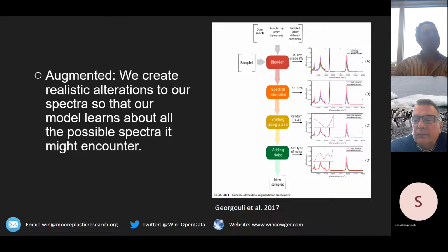But this works. But then how do you remove polypropylene altogether from your samples in pyrolysis? What we did, and also published, is that it was pushed out from the middle of the filter. So the PP is around the edge, once you've done your FTIR. Then you've got that little bit around the edge, and you poke it through, because it's too brittle, into the little cup that's needed for pyrolysis.